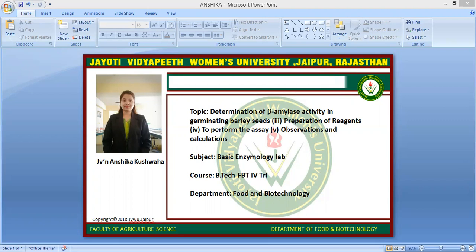For enzyme activity, one drop of iodine solution is placed into each of 21 wells on ceramic plates. The reaction mixture is then prepared by adding 5 ml of buffer solution and 1 ml of 0.5% starch solution in a test tube. One drop of the reaction mixture is removed and added to one drop of iodine — the iodine turns blue-black, confirming the presence of starch in the reaction mixture. The diluted amylase extract is thoroughly remixed and 1 ml is added to the reaction mixture.